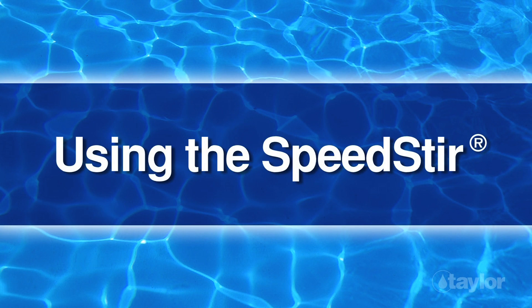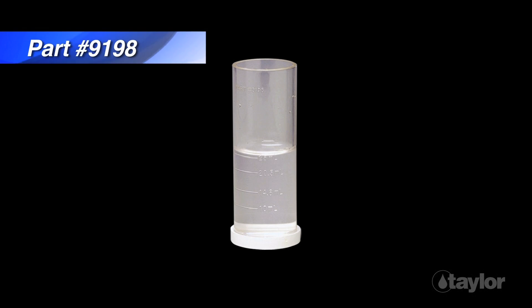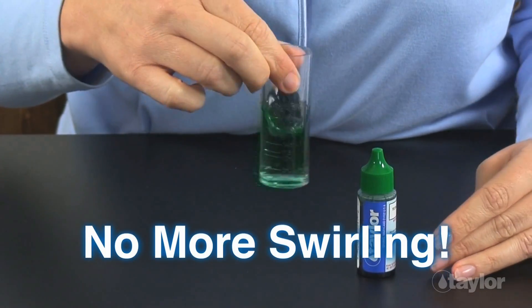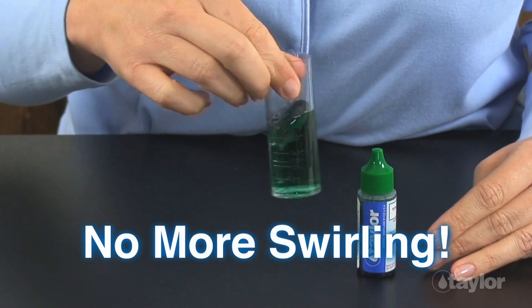Taylor Speedster makes quick work of drop tests performed in the number 9198 sample tube. This palm-sized portable magnetic stirrer will thoroughly incorporate each addition of reagent in a fraction of a second. No more manual swirling.